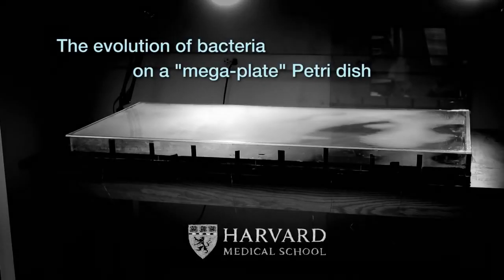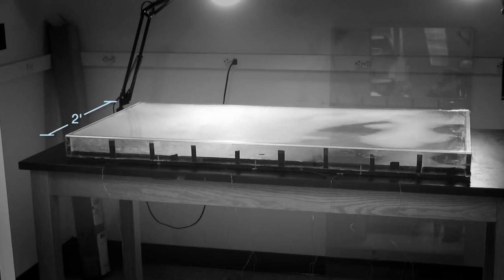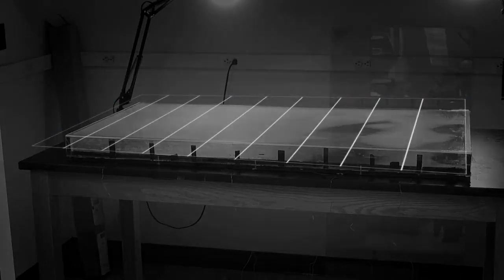So what we ended up building was basically a petri dish, except that it's 2 feet by 4 feet. And the way we set it up is that there are 9 bands, and at the base of each of these bands, we put a normal petri dish thick agar with different amounts of antibiotic. On the outside, there's no antibiotic. Just in from that, there's barely more than the E.